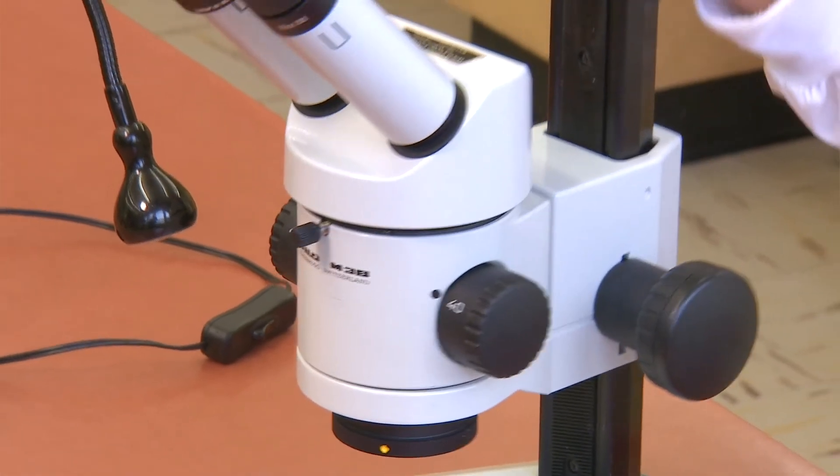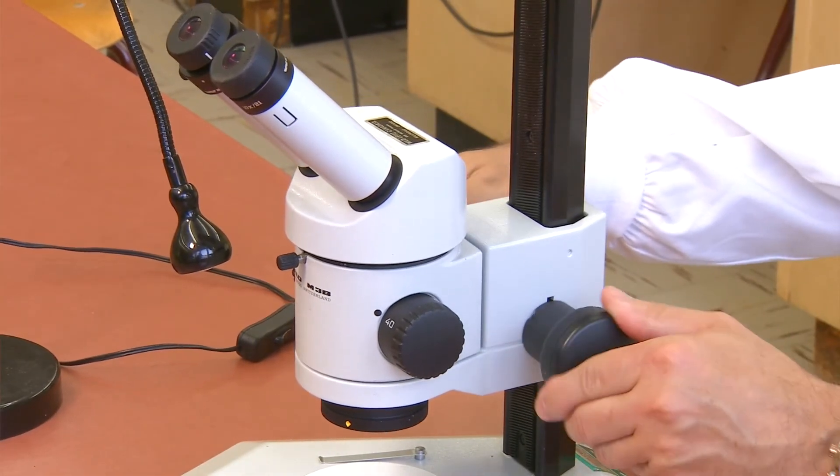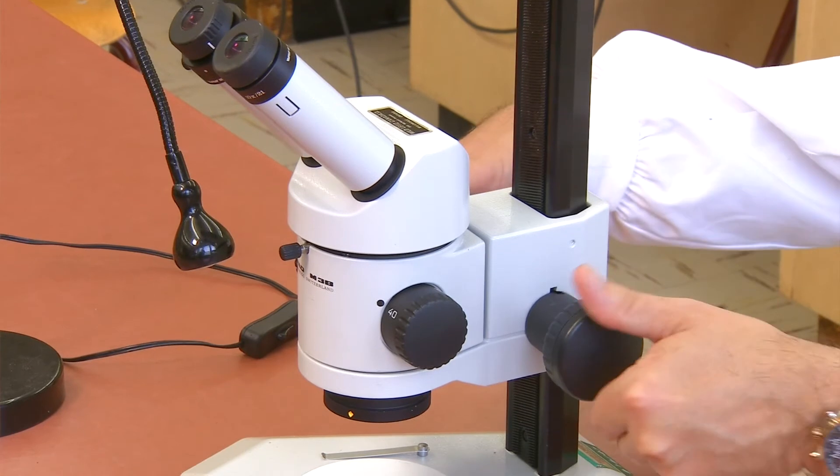All of these parts are attached to the arm of the microscope. Near the arm, you will see the focus adjustment knob. When you turn this, the body of the microscope moves up and down over the base.